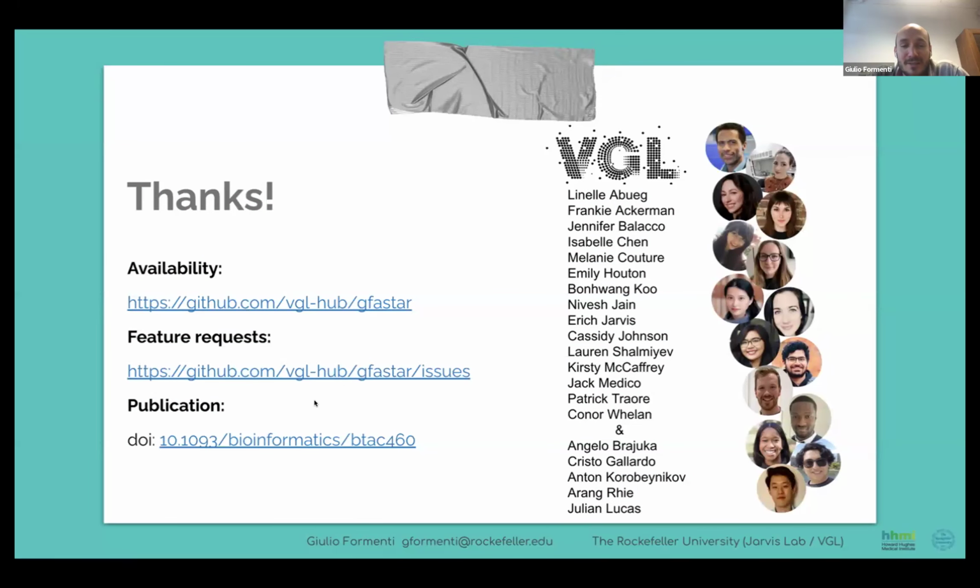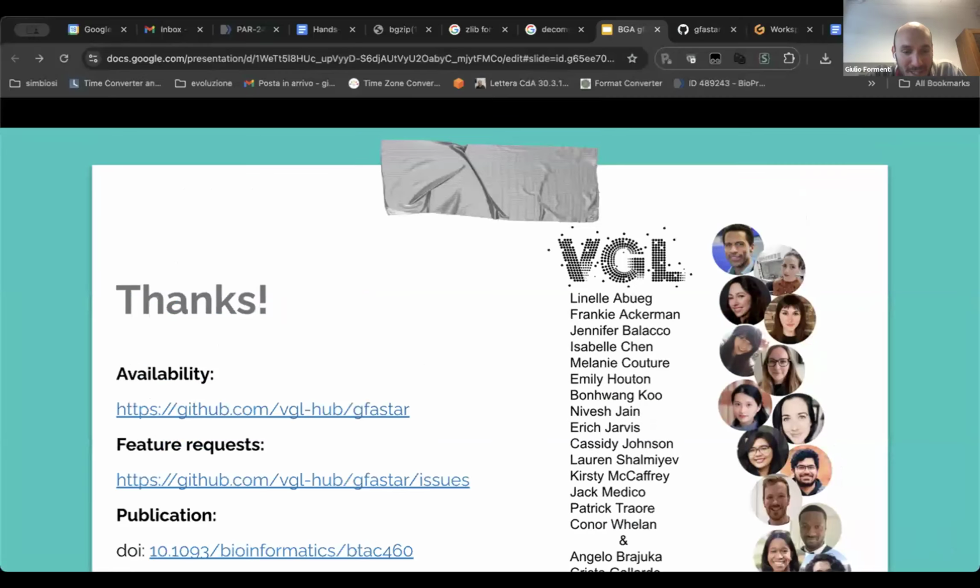Of course, you can find this. All of the code is available in GitHub, and there are releases, and that's what we're going to use right now. Okay, with that, I think I can stop sharing. Maybe I don't know if there are any questions, comments, curiosities, or if not, we can just move straight into the practical. I don't know how you typically do this, but yeah, questions here is fine.